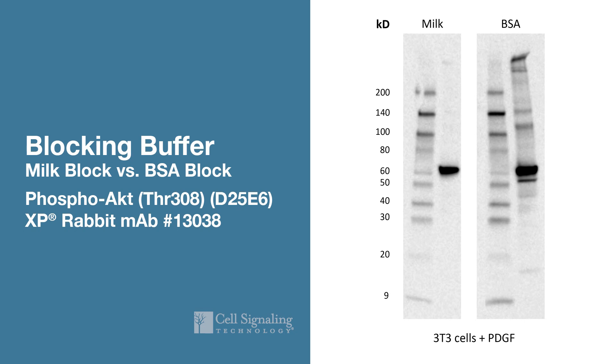These are images of product number 13038, tested on lysates made from 3T3 cells treated with PDGF. The only difference between the blots is that one membrane is blocked in milk and the other membrane is blocked in BSA. Clearly, the membrane blocked in BSA has a much higher background. Yet, phosphosignal is still strong and clean with the membrane blocked in milk.